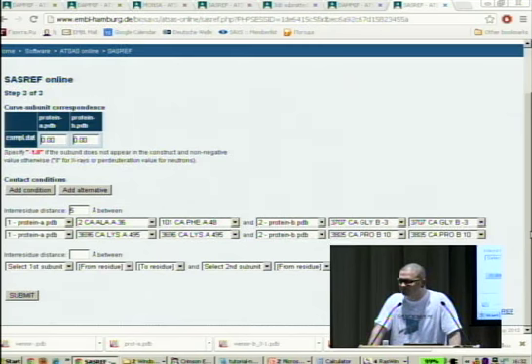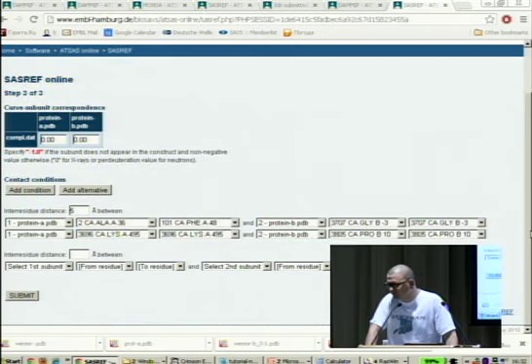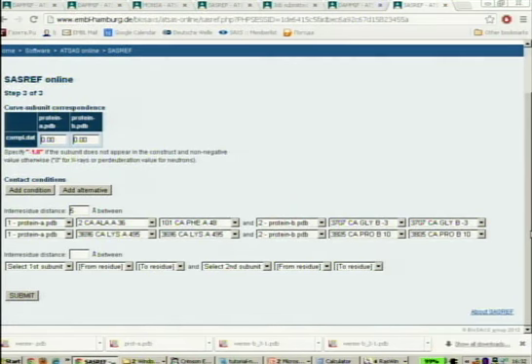Yes, please. You've talked about predicting the linker sequence, the shape of the linker domain, right? If we have two domains and we do not know the shape of the linker, what if I submit a false case? Will the server still predict a linker sequence between them? So if you want to add a missing linker, it will come up with something.